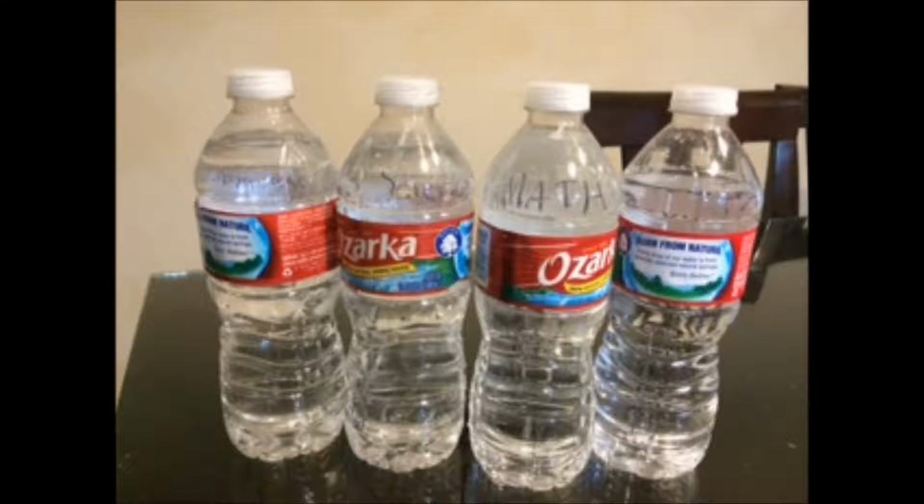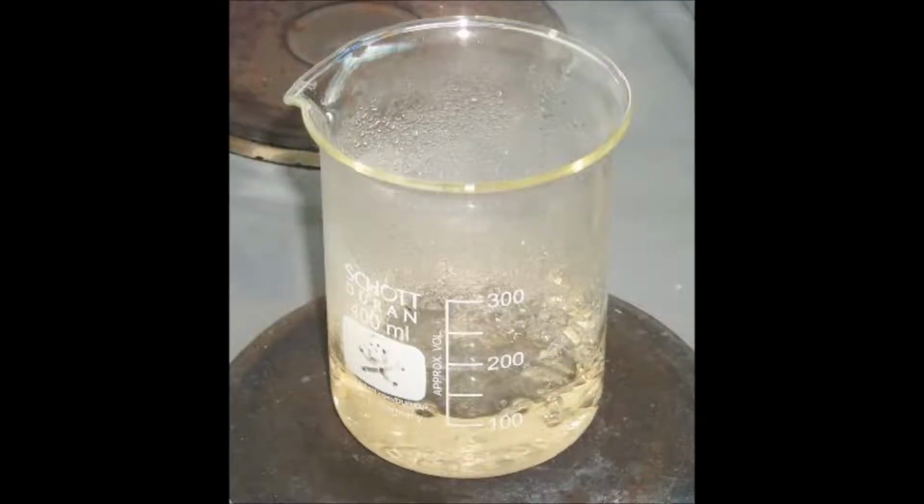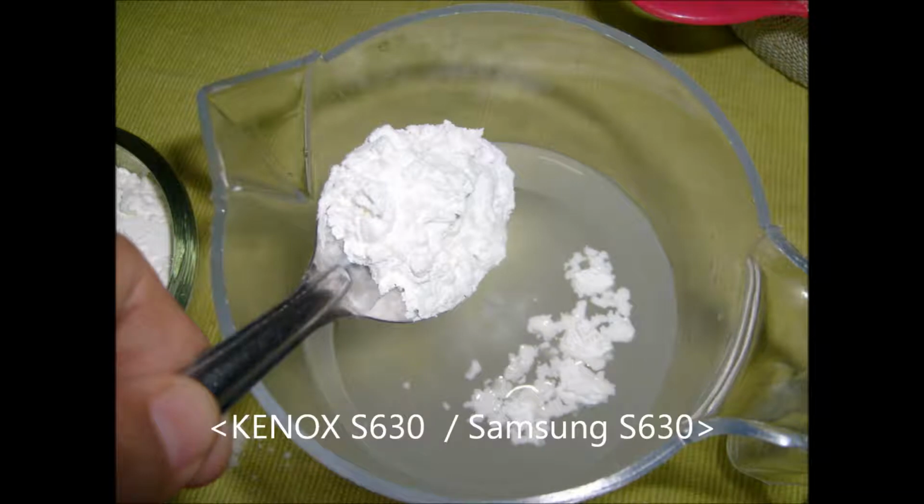Before we could begin, we had to make two solutions that would be required in the experiment. First, we made a starch solution that would act as an indicator. This was done by placing a beaker of about 25 milliliters of water onto a hot plate and heating it up until it boiled. Next, we added in a sufficient amount of cornstarch and stirred until it was all dissolved. The amount of cornstarch or water put in did not really matter because it was only acting as an indicator. After it was dissolved, we turned off the hot plate and carefully removed the beaker and let the solution cool down. Our solution ended up being milky white in color and a little thick.